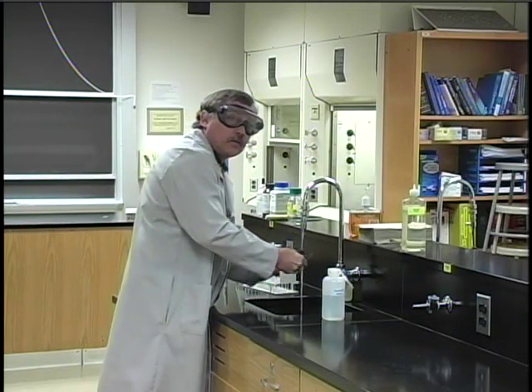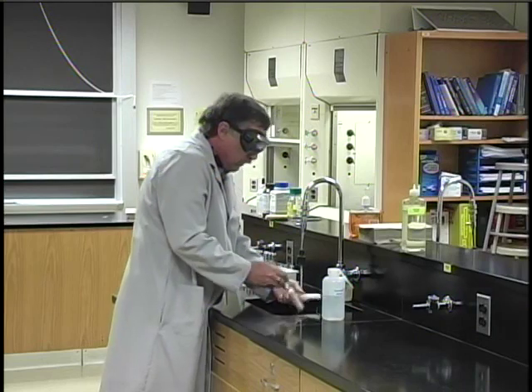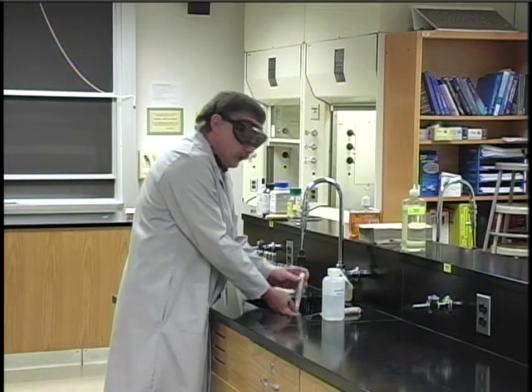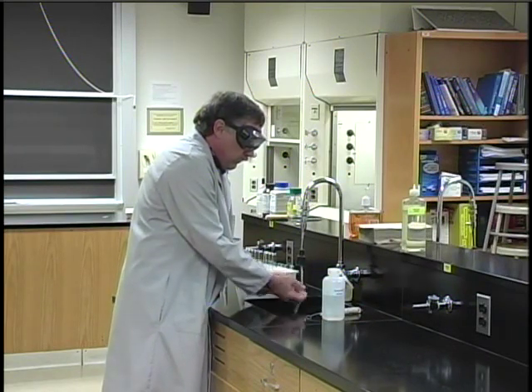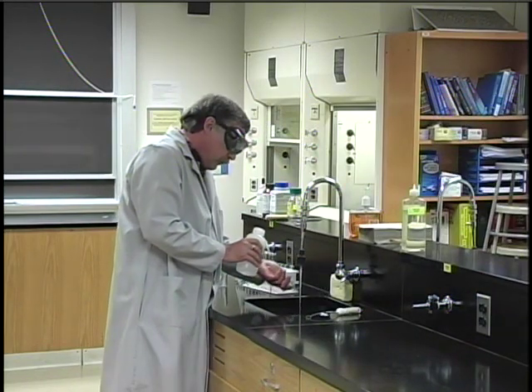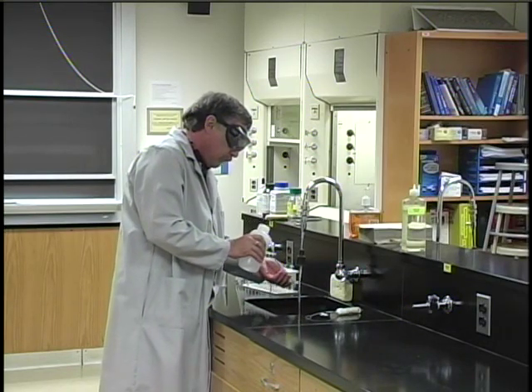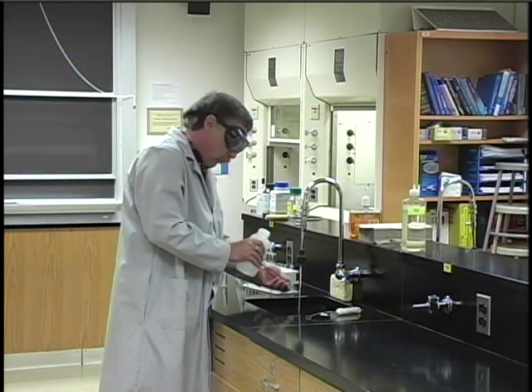When you use the glassware cleaner, just use a couple of drops because it's very concentrated — it's like dishwashing soap. Put a couple of drops in the test tube and use the test tube brush. When you're finished, you need to rinse it several times with tap water until all of the soap is gone, and then rinse it inside and out a couple of times with deionized water to wash away all the minerals present in tap water.